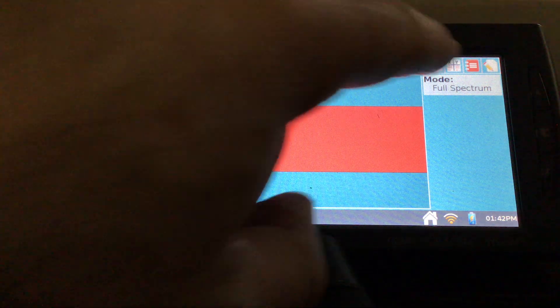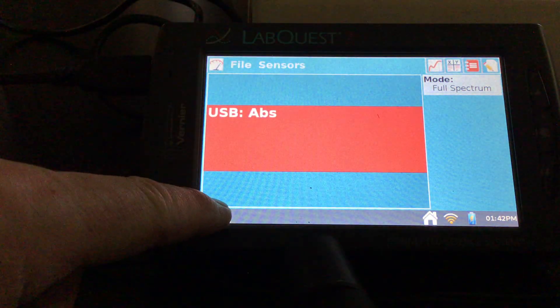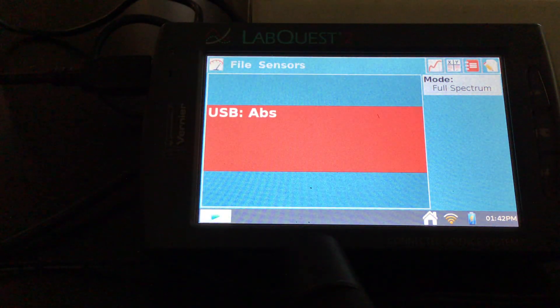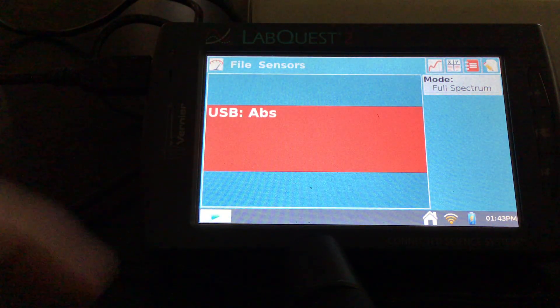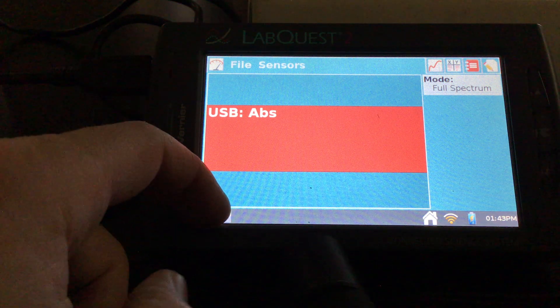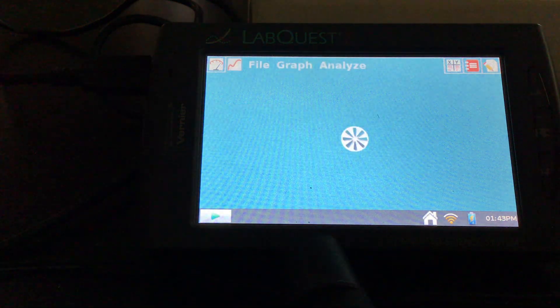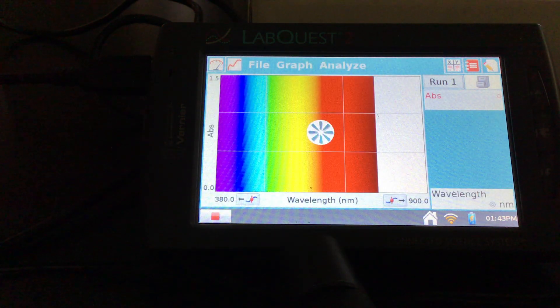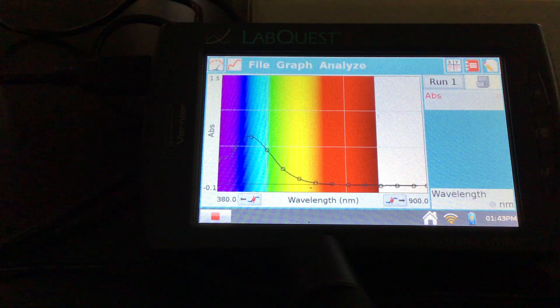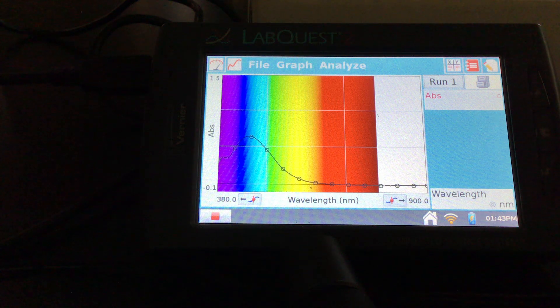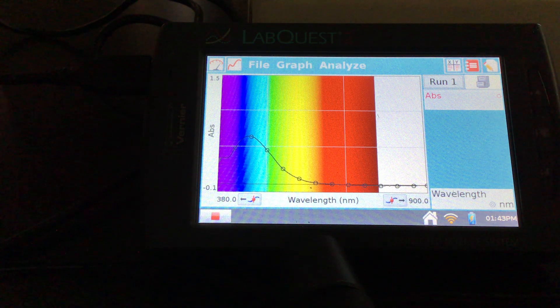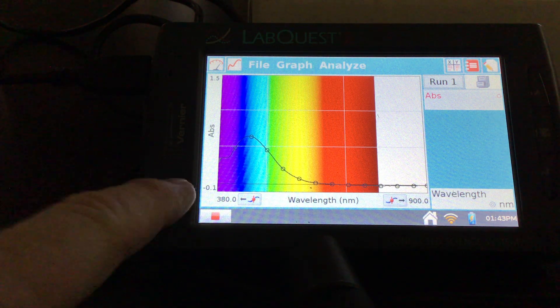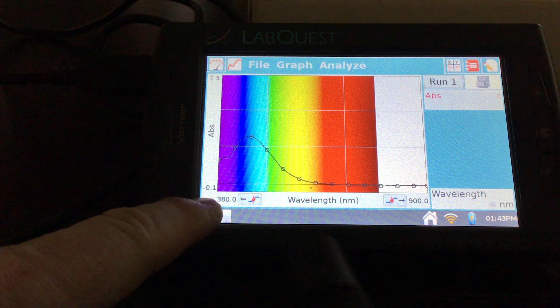And we're in full absorbance mode, so I'm going to hit play. Let's try that again. There we go. And we should be somewhere around 450 nanometers or so for our peak wavelength. So I'm going to go ahead and hit stop.